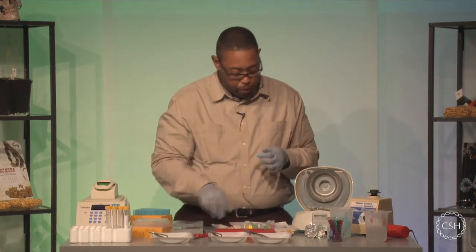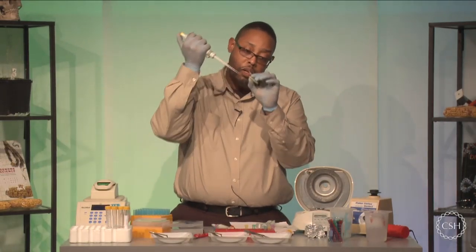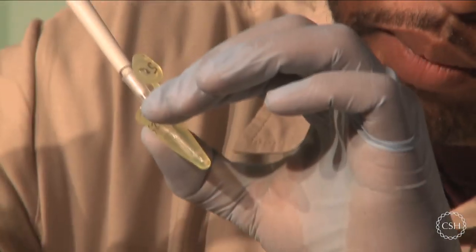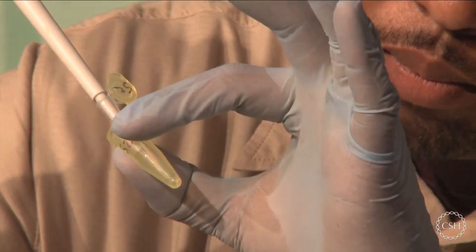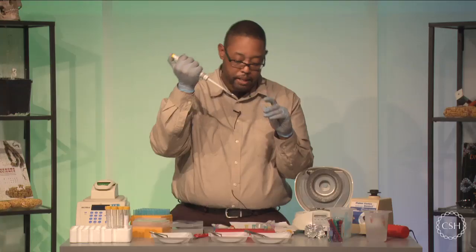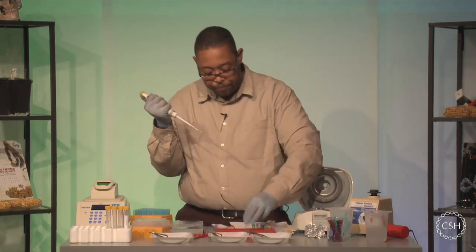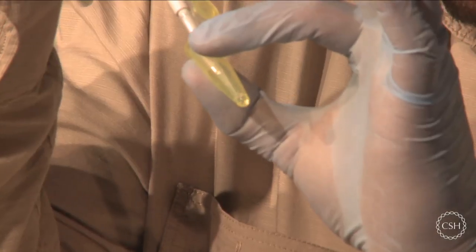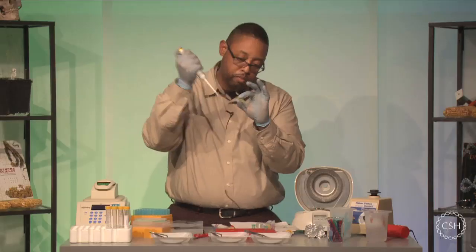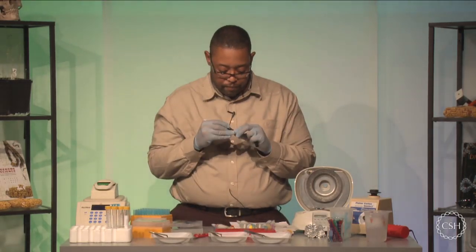I'm going to move to sample number 2. And I'm going to draw 90 microliters out of there. And there I can get almost a full 90. I'm going to add that into my new test tube. And this will be sample number 2, and it's my final.